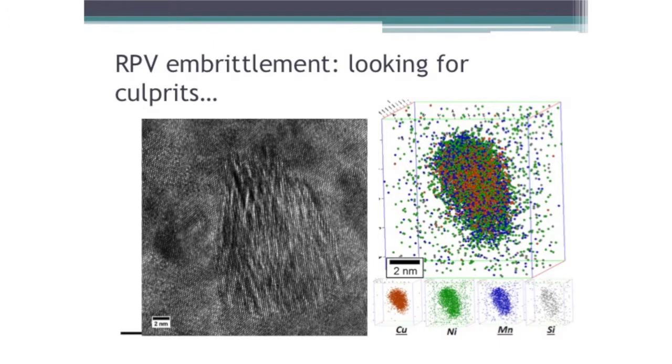And where there should be just a nice uniform structure, we started seeing tiny precipitates. As you can see, this black thing. And these precipitates shouldn't be there. But how did they appear? So we prepared a tiny needle, as I said before, from a region containing this precipitate. We evaporated all the atoms from this region. And this is how they look.